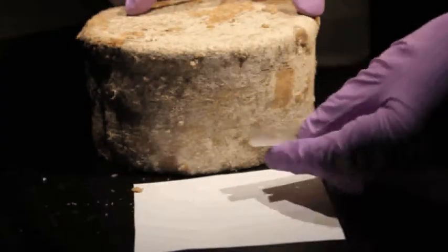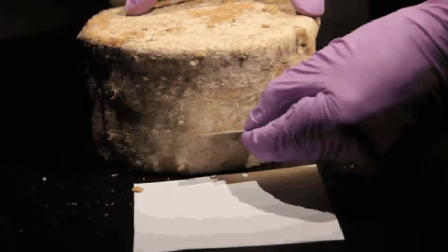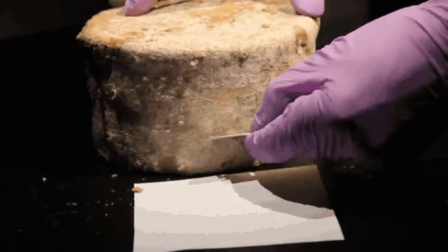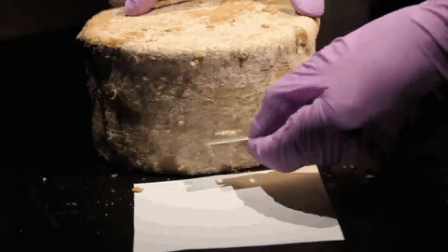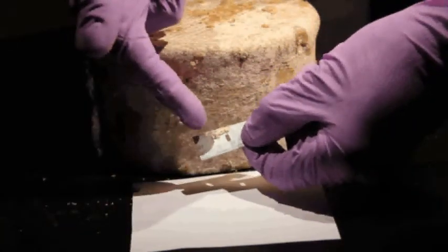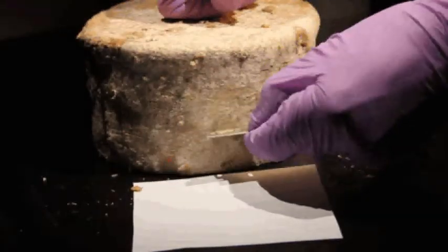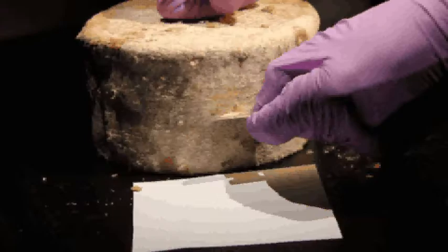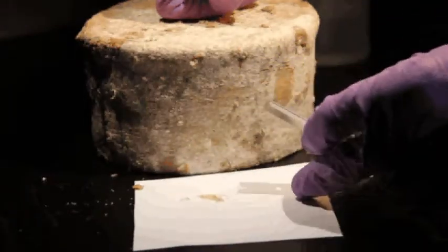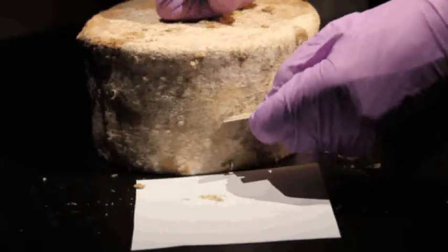To scrape the rind, take the sharp razor blade and press in an upward direction to remove the microbes living in the rind and collect them on the razor blade. You can see the crust or rind starting to collect on the blade. Keep scraping and occasionally drop the sample onto the piece of paper.